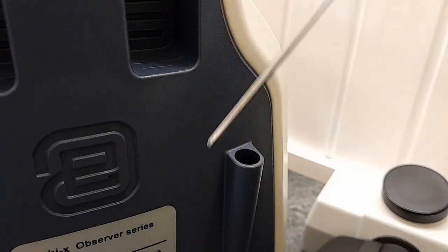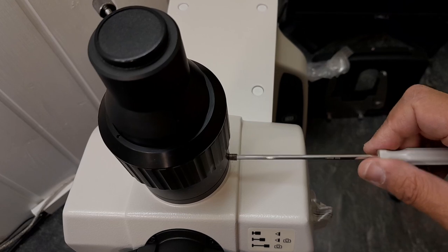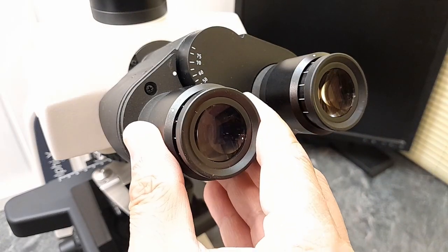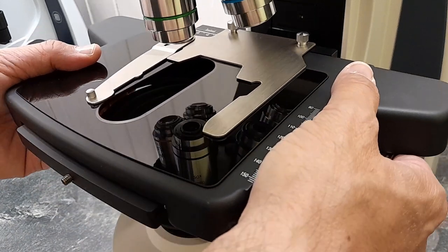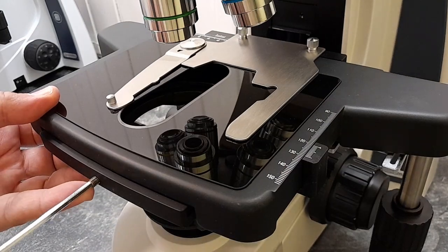I first removed the protective plastic covers from the head and from the body. And then I used the provided tool to connect the head to the body. And much in the same way, I also connected the photo tube. I also dropped the eyepieces into place. And then last but not least, I also had to connect the stage. The stage slid into place and only had to be tightened and fixed with a small screw right in the front. I generally like it when microscopes are that modular because it makes, of course, maintenance much easier. And the microscopes can also be upgraded much more easily this way. So after about three or four minutes of assembly, I was able to put the microscope into operation. And we're now going to have a look at some of the features. Or as a matter of fact, at all of the features the microscope has to offer.